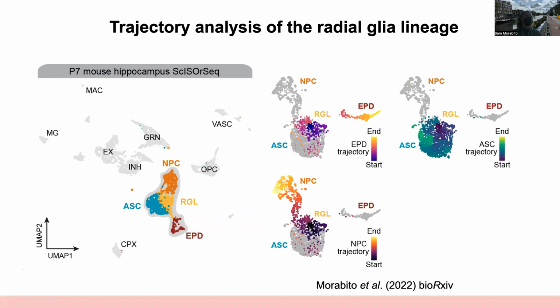By default, Monocle 3 will run the trajectory separately for each partition. You can force it to put them together, but I think that is a recipe for disaster, because then you'll have cell types that aren't giving rise to each other connected in the pseudotime. So that's another thing: this is prone to user error, maybe more than clustering is.